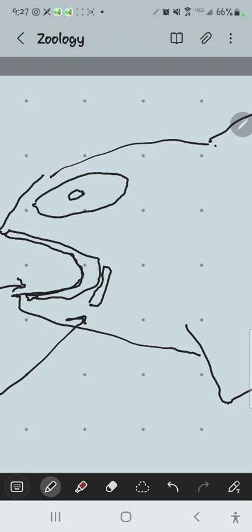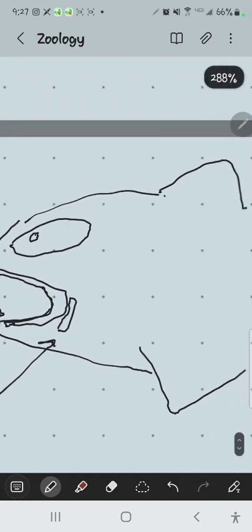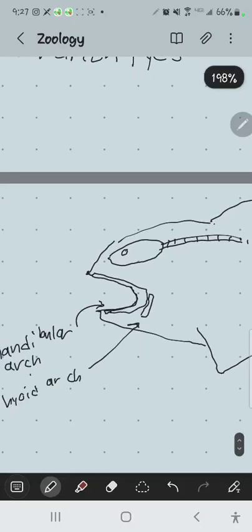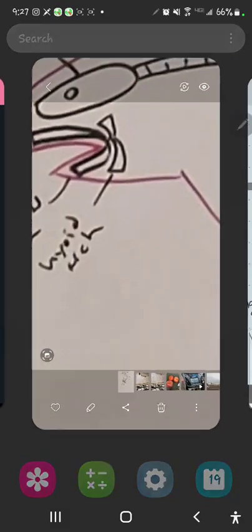But you should recognize that the mandibular arch is the front arch on this one. The one with the teeth on it is the mandibular arch. The hyoid arch has no teeth. Speaking of teeth, because these are cartilage structures, the teeth are not derived from the arches at all. The teeth are modified scales.